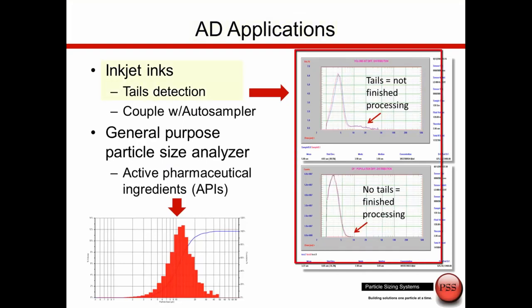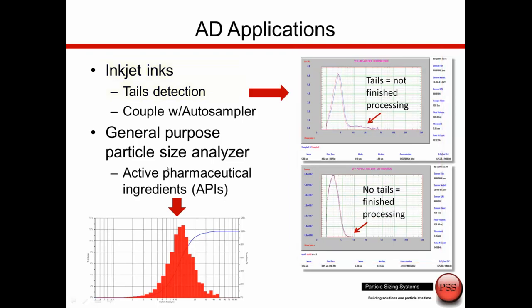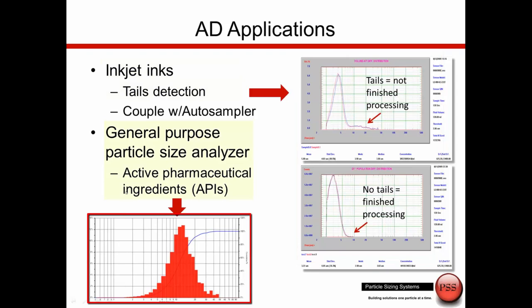Typical results from the AccuSizer AD include inkjet inks. In the upper right, an incompletely processed sample still has a few large particles that can cause performance problems and clog inkjet printer heads. In the lower right, after milling the pigment, there are no particles greater than 10 microns and the ink is suitable for the final product. Another application is as a general particle size analyzer, shown here for an active pharmaceutical ingredient — powdered API dispersed in liquid.